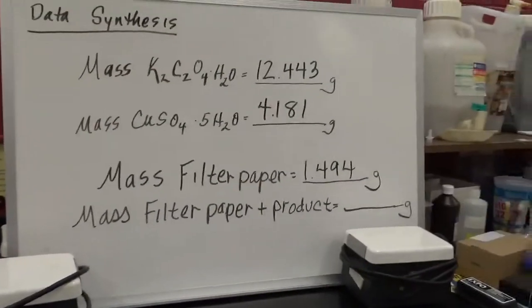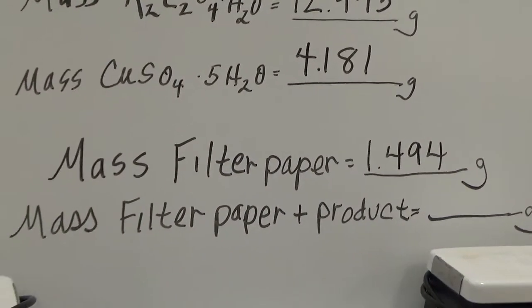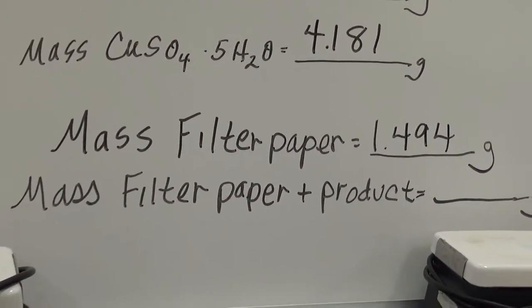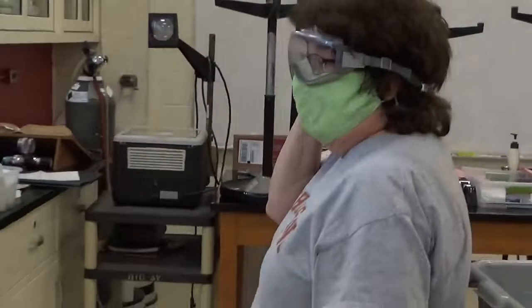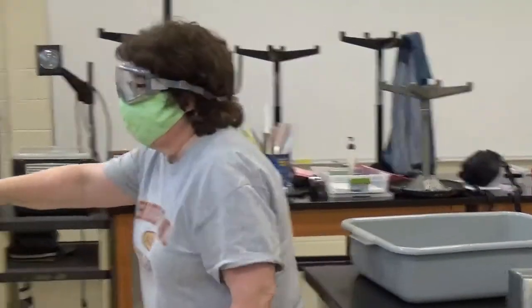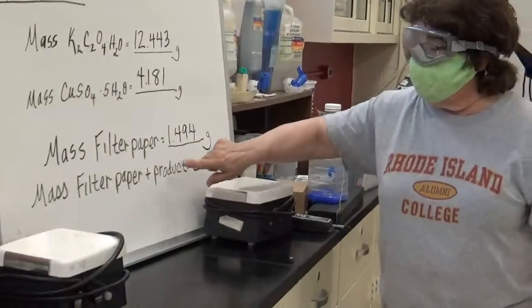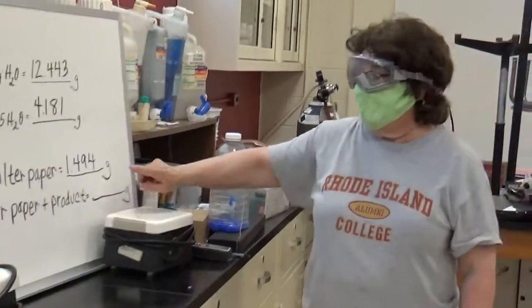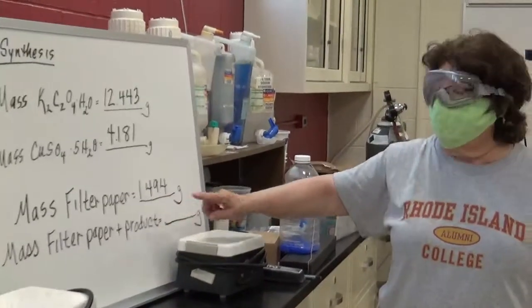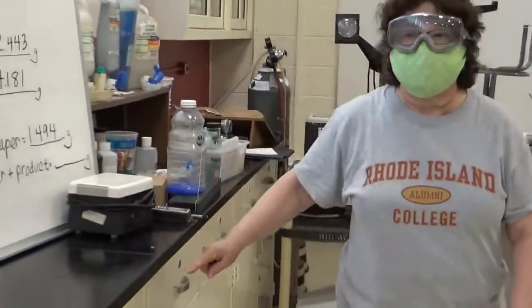Now what's going to happen is we're going to be collecting our product in the filter paper and drying the whole thing next time, and we are going to be writing the total of the filter paper plus product here. And to find the amount of product, all we have to do is subtract these two, and we should be able to get that.